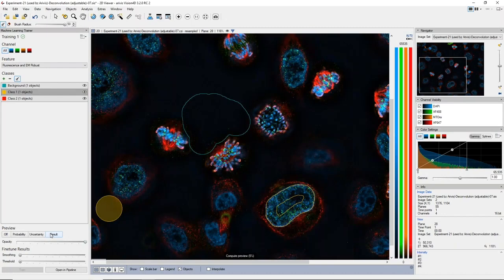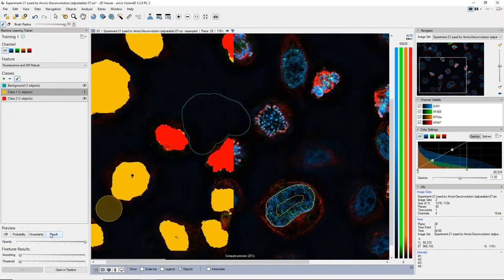But the advantage of this method is that while the computing is more resource intensive, because we are generating all these images in the background, the advantage for the end user is that they don't need to be trained on the nitty-gritty of segmentation techniques. What does a threshold mean? What are the best filters to enhance an image, and so on and so forth, because the software just tries everything and then produces the results, as you can see here.